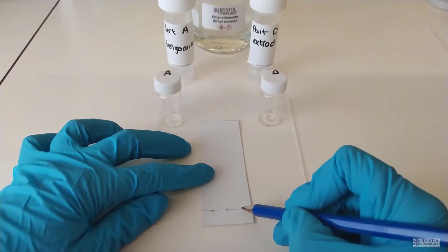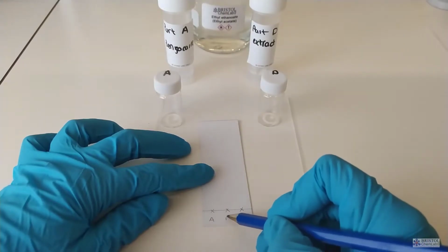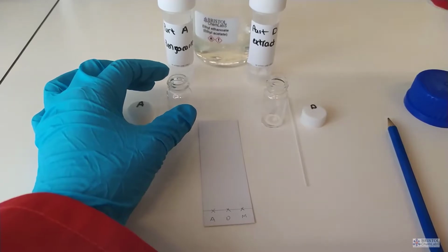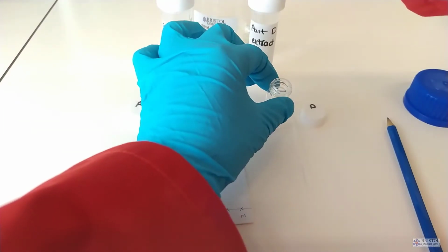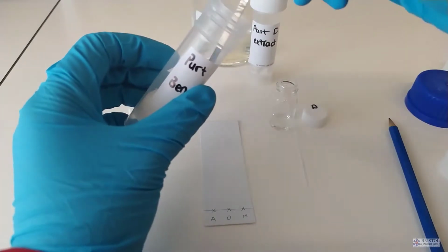When handling a TLC plate, it's best to hold it by its edges so you don't transfer any contaminants to the face. To mark up a TLC plate, pencil, not ink pen, must be used. Draw a straight line to mark the position where you're going to apply the samples under test.